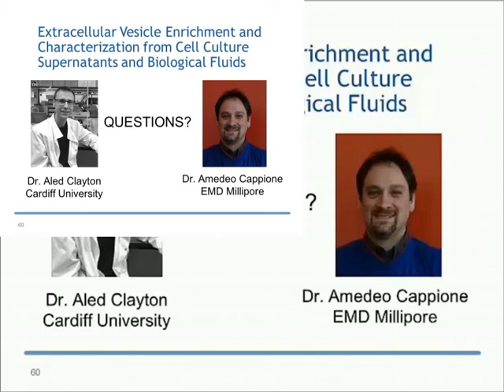Can I launch in on this one? Sure. This is a particular question we're quite familiar with. When we started doing proteomics of vesicles a few years ago, we found that the mass spec facility was really struggling to give us any protein identifications at all. We tracked back through the workflow and found that the solubilization of the vesicle preps was extremely poor. Even if you take an exosome prep and boil it for 10 minutes in SDS buffer and then run that down a gel, the vast majority of that sample will sit at the top of your stacking gel. It won't really enter the gel. It's incredible how robust these vesicles seem to be.